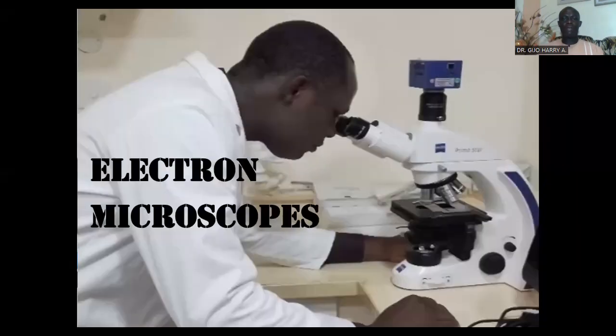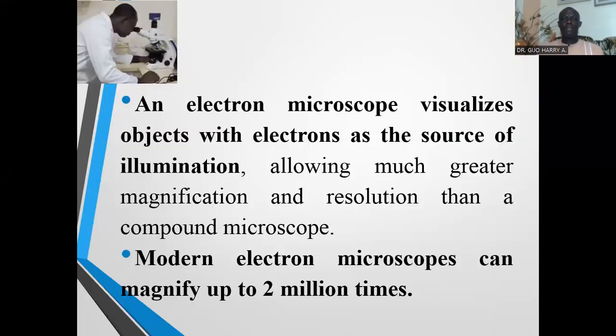We have looked at the light microscopes or the optical microscopes earlier. We had discussed the different types of optical microscopes. So today's lecture will be on electron microscopes. What are electron microscopes? An electron microscope visualizes objects with electrons as the source of illumination.